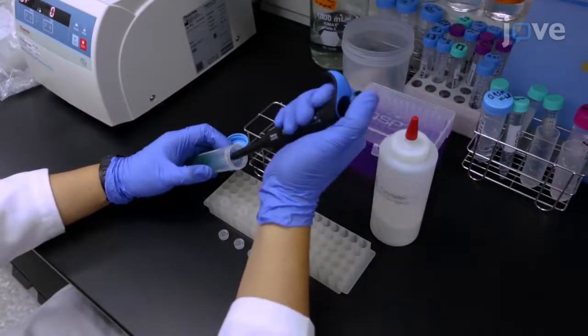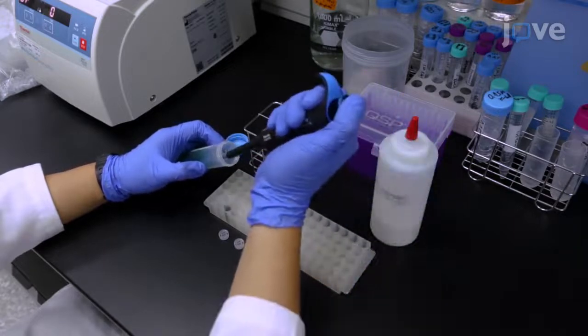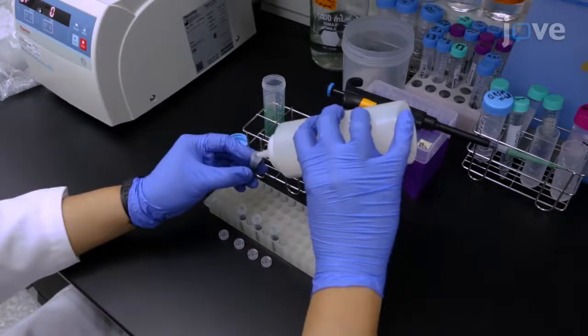Add 1 mL of cell suspension and 0.4 to 0.6 grams of 0.1 mm glass beads into a 2 mL screw cap vial.